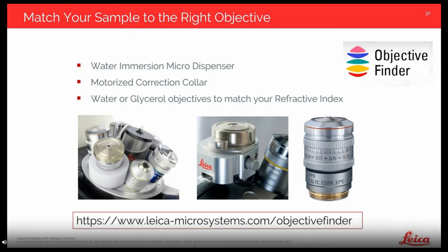We also have many with correction collars for allowing different thickness of sample holder to image through. So while we have all of these different options, it may be a little hard to find the one you need. So we've actually come out with what we call Objective Finder. And this allows you to search through our extensive catalog of objectives and really choose the objective that's correct for you and your application.